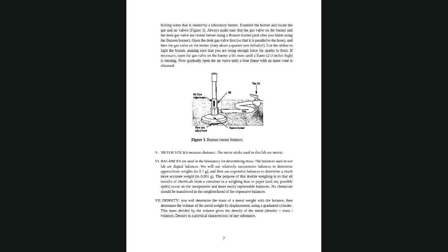For the air valve adjustment, by rotating this movable cylinder here, you can lower the amount of air combining. If you don't get enough air to mix with the gas that is burning, you would get incomplete combustion. How does it show? It will show a yellow flame, and the flame is not going to be hot.